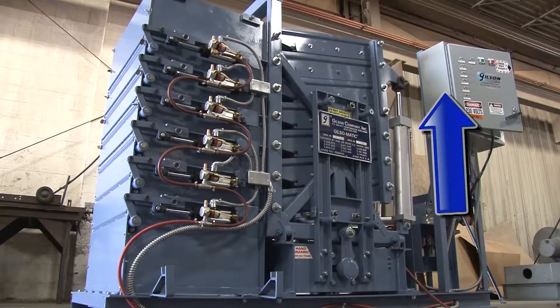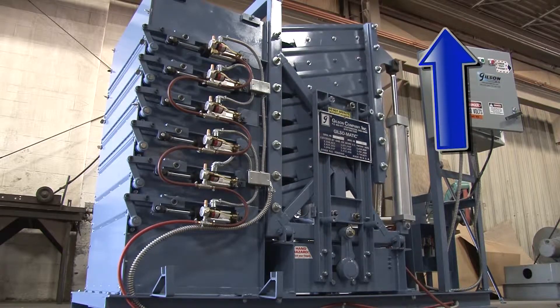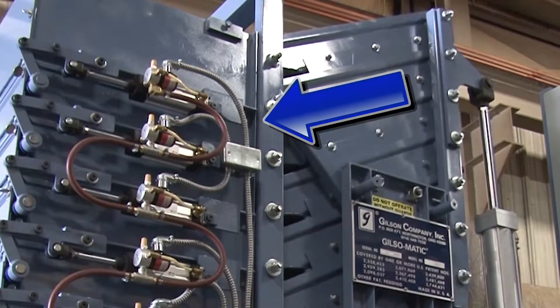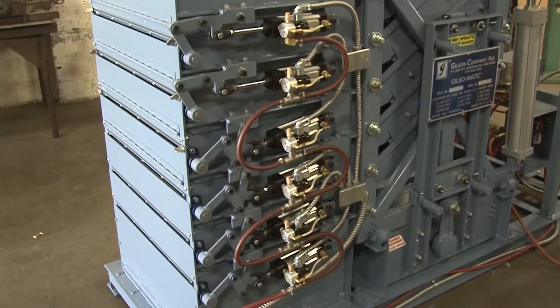After each batch is screened, air-actuated cylinders tilt the screen decks and fine collection pans to discharge fractions into individual collection chutes, with each chute independently powered for total control release of holding material.